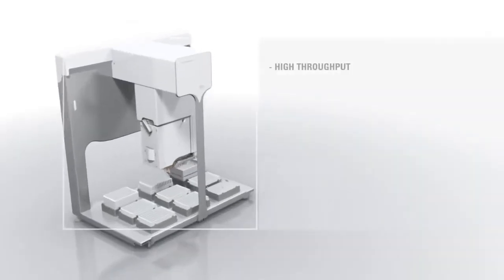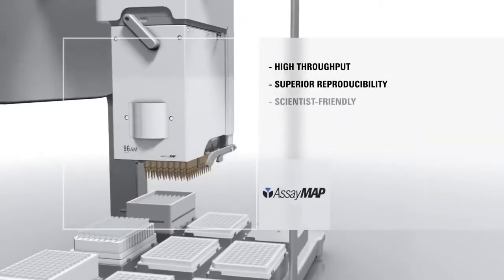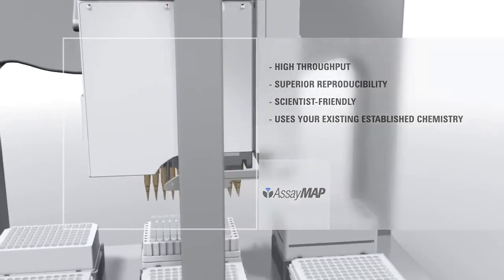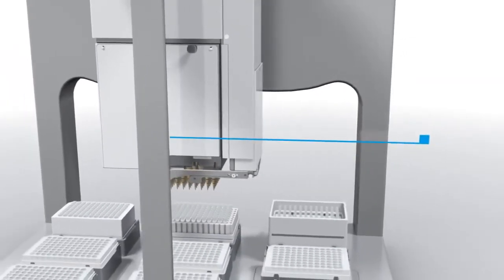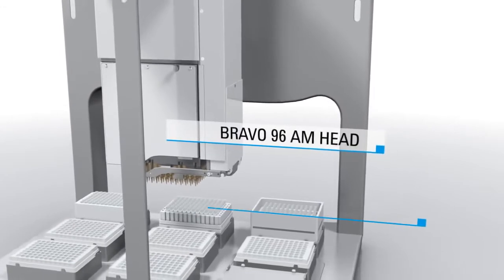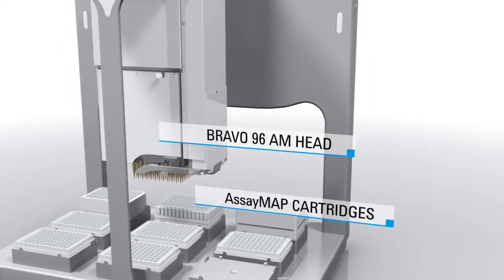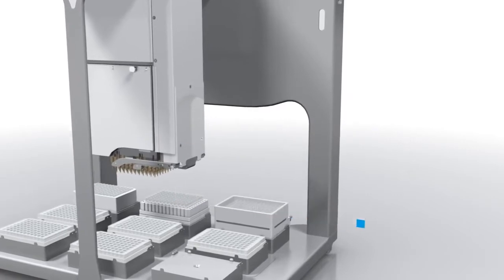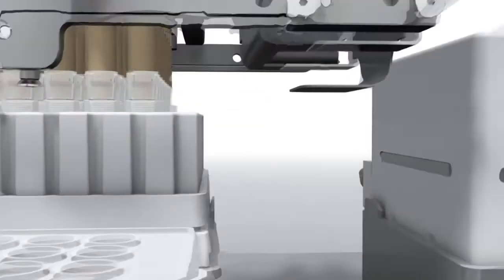This open automated platform leverages the high-throughput, best-in-class automated liquid handling of the Agilent Bravo 96AM with the AssayMap Microchromatography technology to enable true chromatographic separation with precision flow control. You can use established purification methods so you can spend less time developing and validating assays and more time generating critical data.